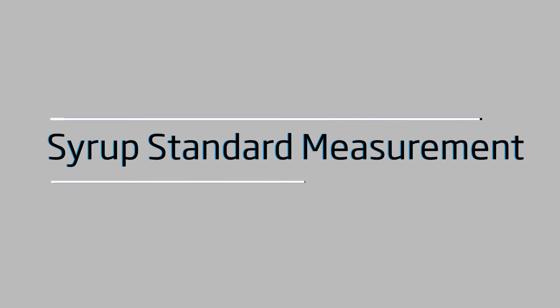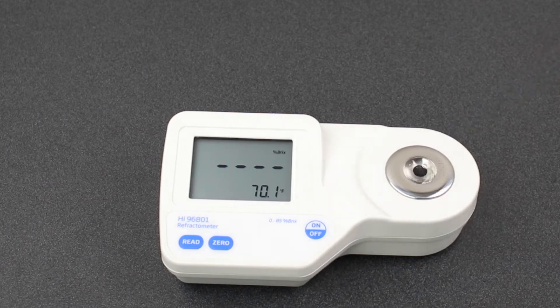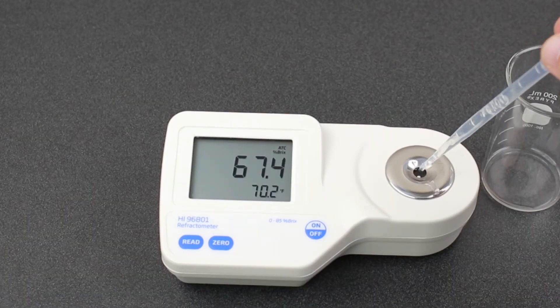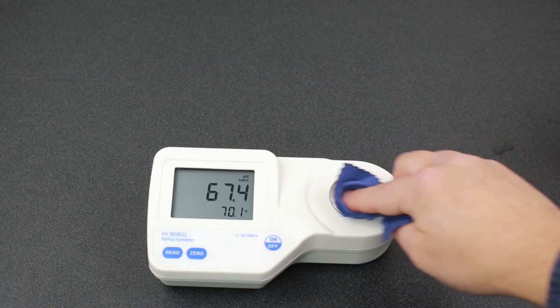First we'll measure our syrup standard. When measuring, it's best practice to make sure your syrup sample has cooled down. Even though the refractometer has automatic temperature compensation, you want to make sure not only that the sample temperature is within the range of the refractometer, but that it is stabilized — this is necessary for an accurate measurement. Fill your sample well, cover with your hand, and press read. Once you get your reading, clean the glass prism by removing your sample with a pipette, then rinse with DI water, and finally dry with your microfiber cloth.